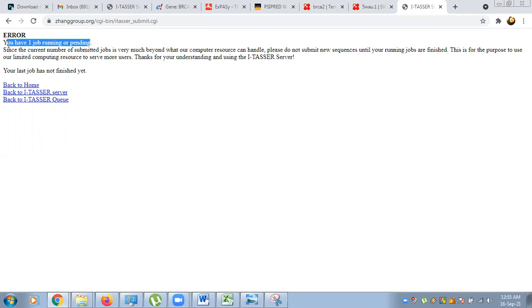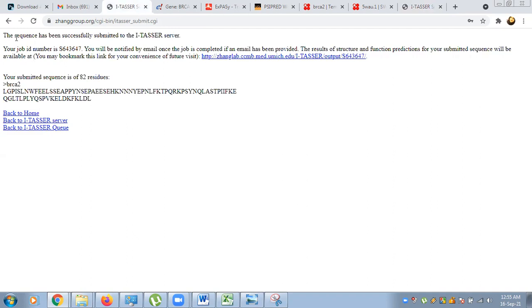They will email the results with the protein image, I think within 24 hours. And in better cases, they can email us within 6 hours or even 2 hours. So if 24 hours is passed and you do not get any email with the protein structure result, you can email them. They will provide you with this email address after you submit your job, and they will ask you to email them if you do not get your result within the time.